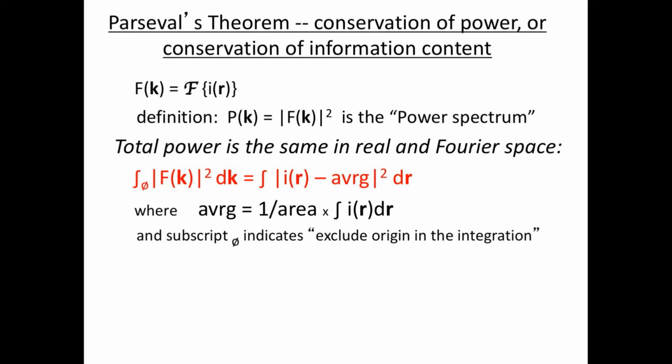So we can always enhance the signal-to-noise ratio by the factor of the areas between the total area of the Fourier transform and this resolution domain, because we simply throw out all contributions due to noise.